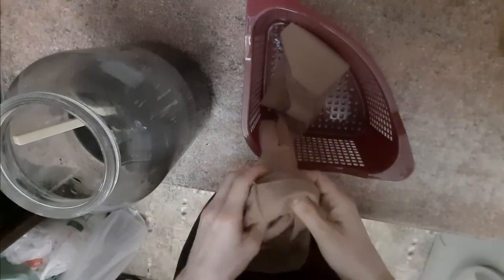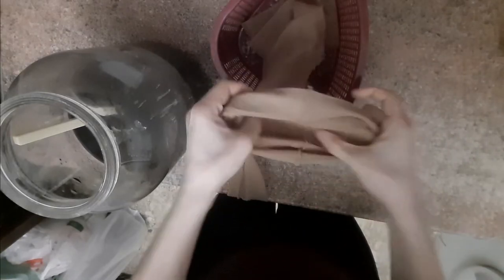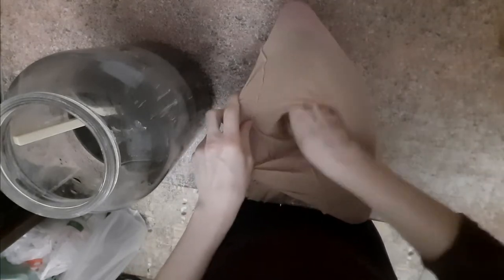Чтобы нам было удобно переливать вот эту вот жижу так называемую нашу, можно колготки натянуть на что-нибудь — на какое-нибудь сито или что-нибудь похожее, подобное — чтобы получился эффект воронки. Сюда соответственно мы это выльем, всё это попадёт в одну колготину, и потом уже мы будем это промывать. Посмотрим, что из этого выйдет. Такой маленький лайфхак.